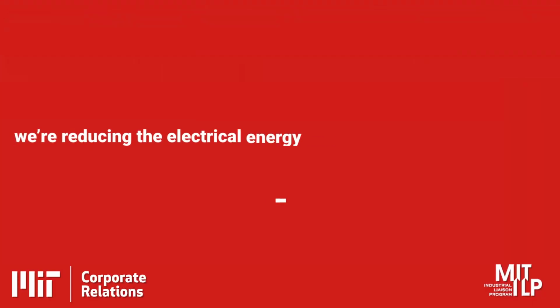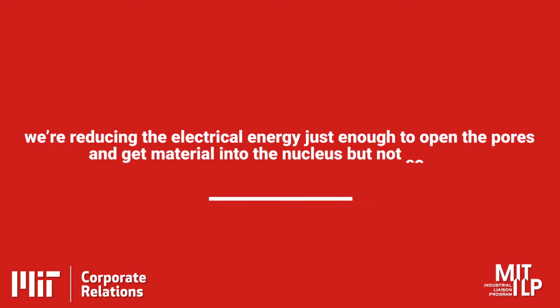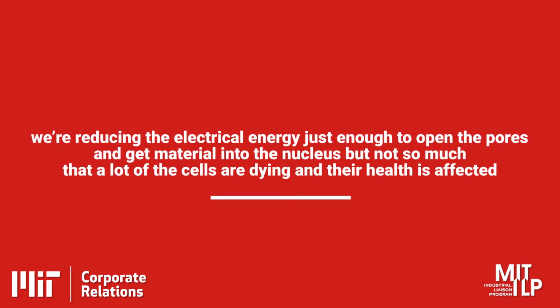And so you could think of it as we're reducing the electrical energy just enough to open the pores and get material into the nucleus, but not so much that a lot of the cells are dying and their health is affected. And so it's kind of like the best of both worlds. So trying to get the health of the mechanical systems, but still delivering to the nucleus, which is what you need to do if you're going to engineer cells for stable genetic engineering, where you want those cells to have an edit that'll persist for a long time.